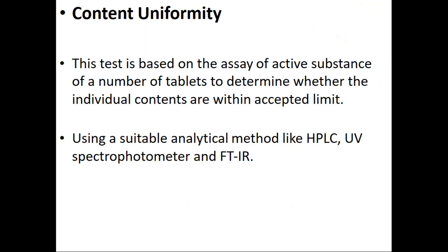This test is based on the assay of active substance of a number of tablets to determine whether the individual contents are within accepted limit.